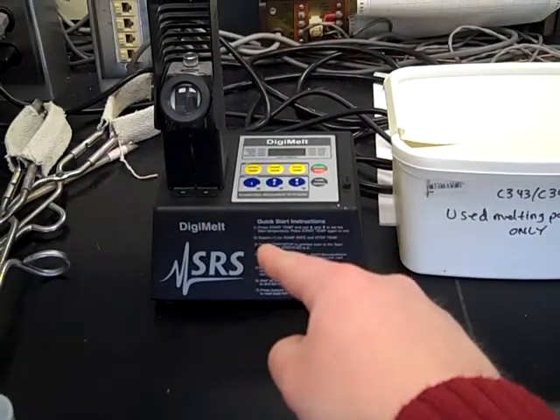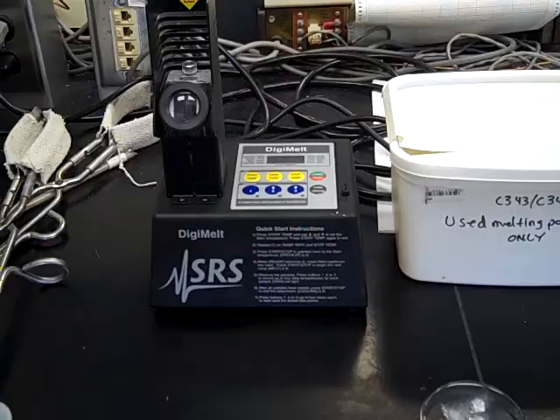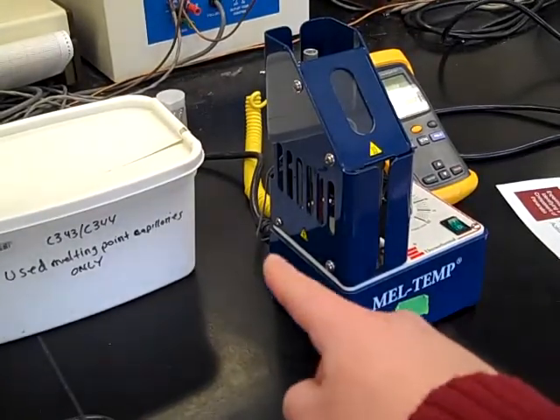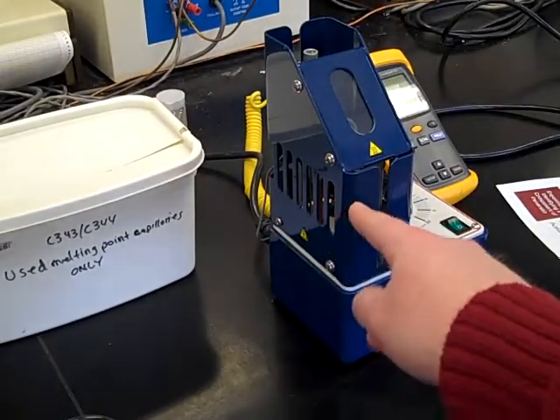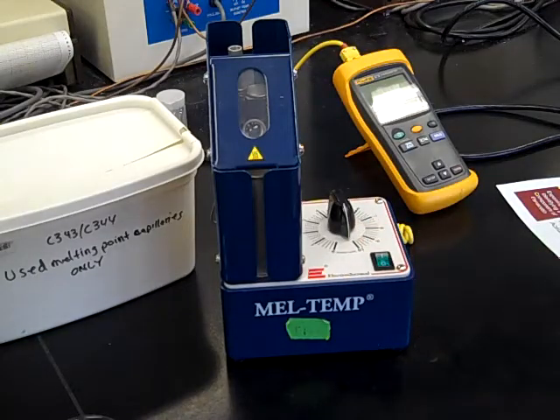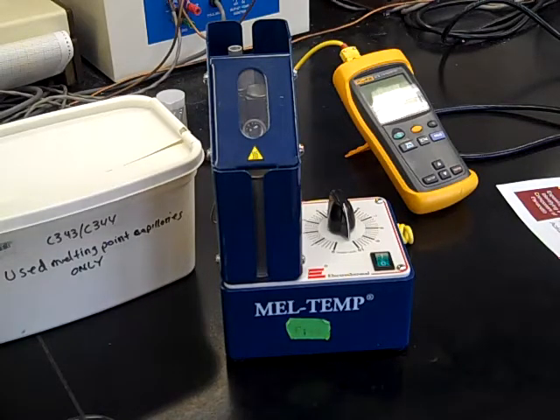The apparatus you'll be using should look like this — it's a much more modern, electronic, programmable version. Also available, and probably much more common, are melting point apparatuses with a manual dial where the temperature increase is not digitally controlled. It's a little bit tougher, so we have the luxury of using the programmable ones, but an apparatus like that works the exact same way.